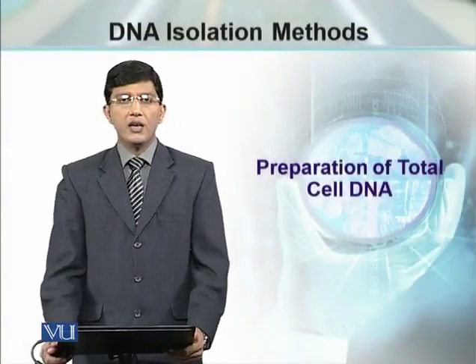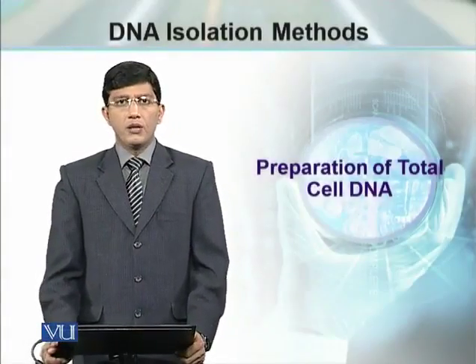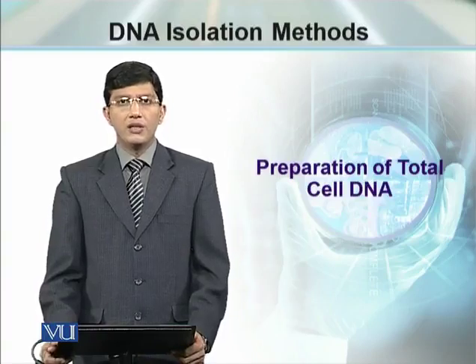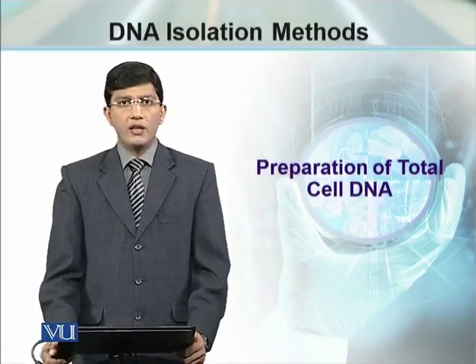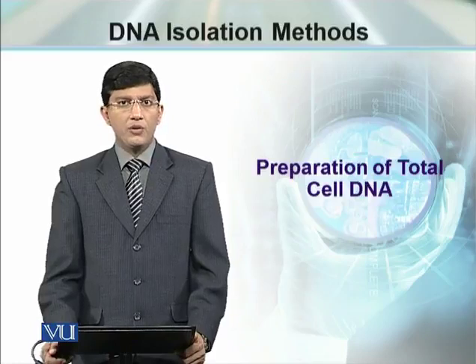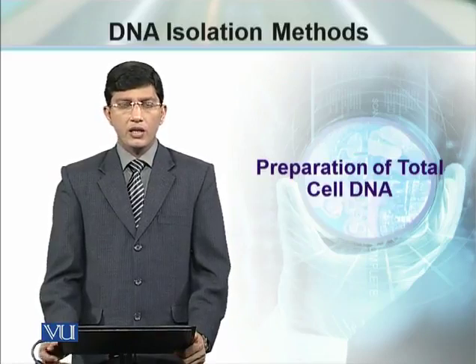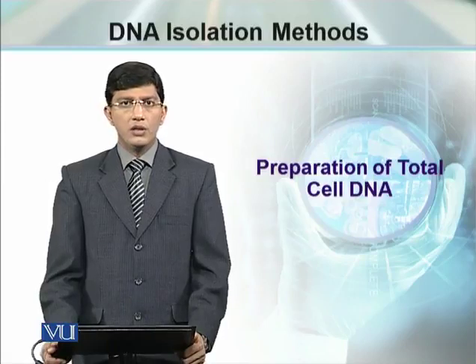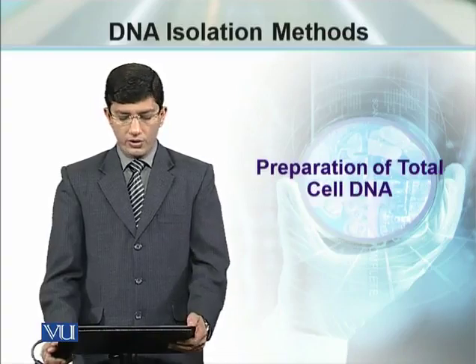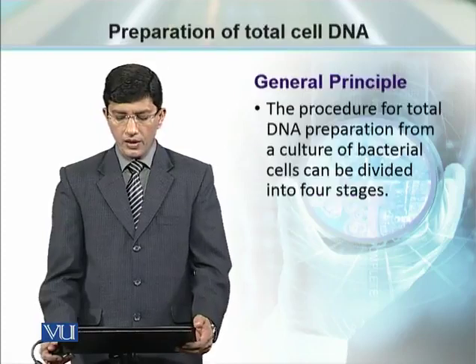जैसा कि हम कल्चर मीडिया के हवाले से बात कर चुके हैं, बैक्टीरियल कल्चर और माइक्रो ऑर्गेनिज्म कल्चर once it is established, बायोटेक्नोलॉजी में जो नेक्स्ट स्टेप है, that is to isolate the DNA for further study. This study can be of different types, but we are at the moment going to talk about the isolation of DNA, how many steps are involved and how we can go further with isolation.